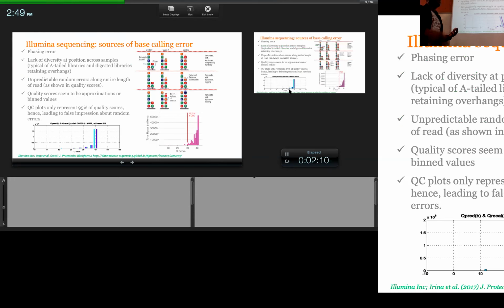So you're going to be getting erroneous signals. Basically, you start getting multiple signals from the same cluster, and that affects your quality score, because the quality score is based on how pure that signal is. It wants to read a red. If it's reading a red and starts seeing a smudge of green inside your red, it's going to penalize that curve.